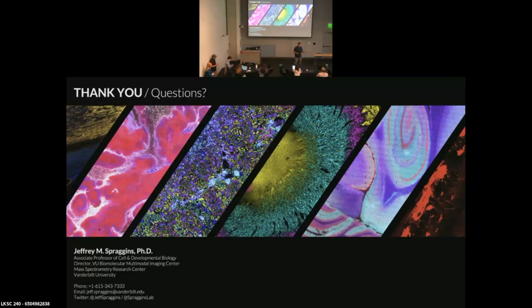Yeah, there are two questions there. First, I think you're probably going to hear about FFPE experiments. That's totally doable. If you're adding enzymes, particularly in the N-glycan experiments, or if you're looking at a tryptic digest of proteins, which you can do, you can spray trypsin to get at larger proteins. FFPE is fine. We actually get reasonably good lipid data from FFPE samples. That's not so much of an issue.